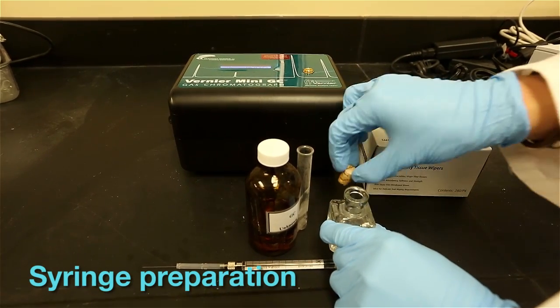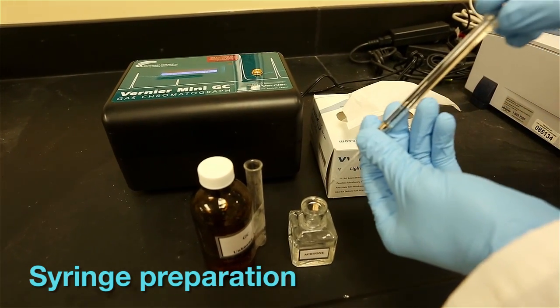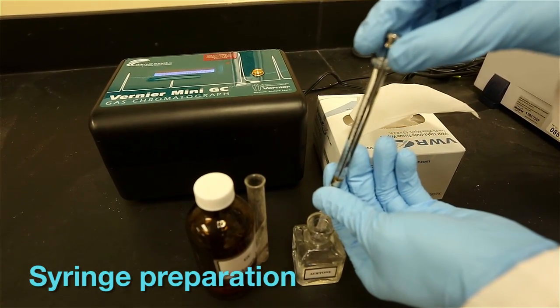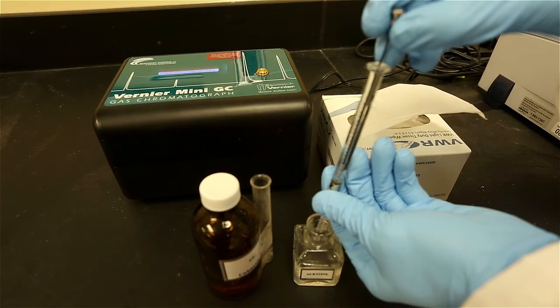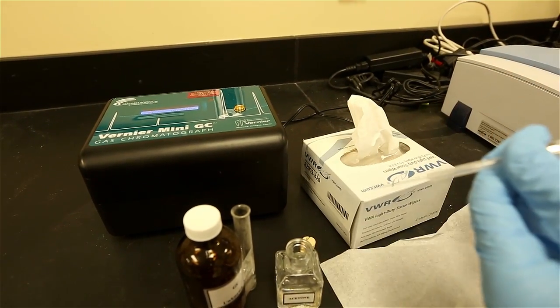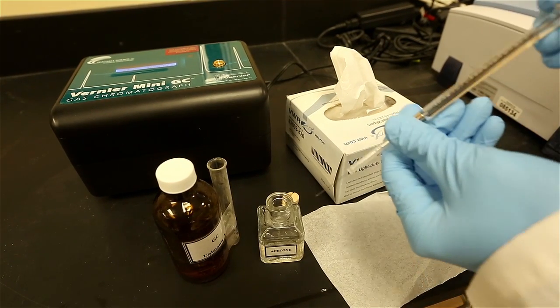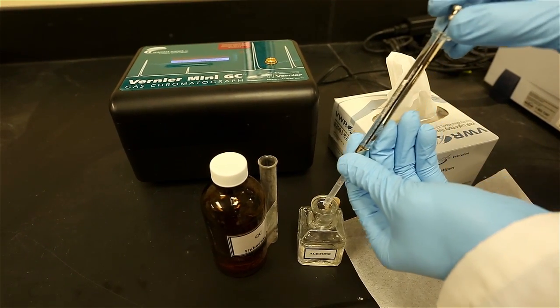Samples are introduced to the GC instrument by a glass syringe. You should be aware that these micro volume syringes are very fragile and very expensive to replace. Please handle with caution and do not pull the plunger back more than 50% of its total volume because the plunger could be pulled out and it is nearly impossible to reinsert it back into the syringe barrel.